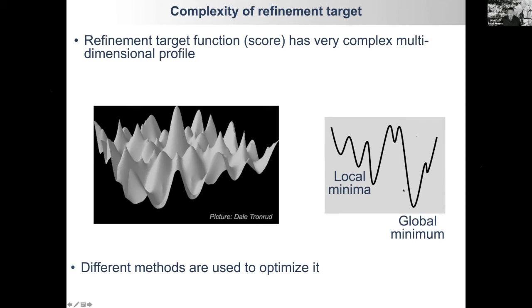And to make this happen, there are different tools, optimization methods, which are mathematical procedures to optimize your target to get you to the deepest possible minimum. That's the objective of that stage, to change model parameters to get to the deepest local minimum.